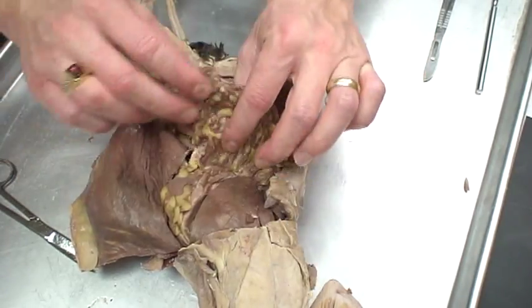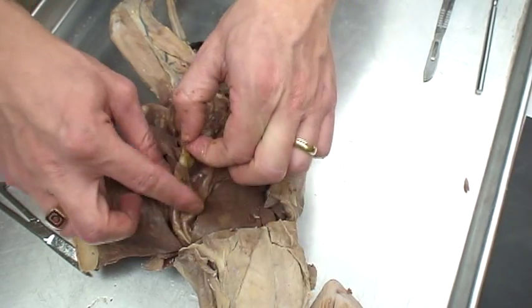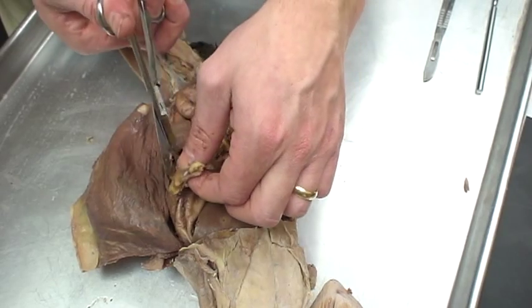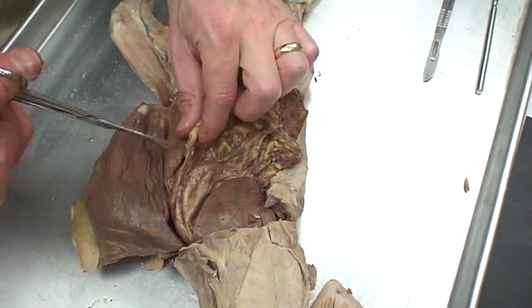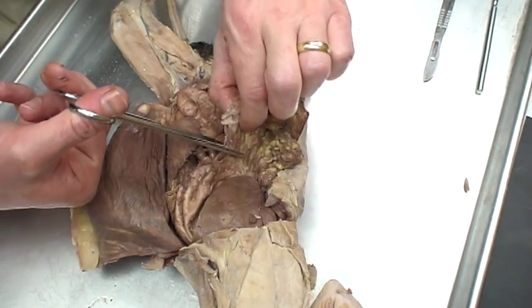This is the greater omentum — our bodies have it as well. You'll see a lot of times the fat that's built up in there. Men tend to store fat in the greater omentum a little bit more readily than women, so you'll see a lot more pot-bellied men than women. Not in myself, of course.